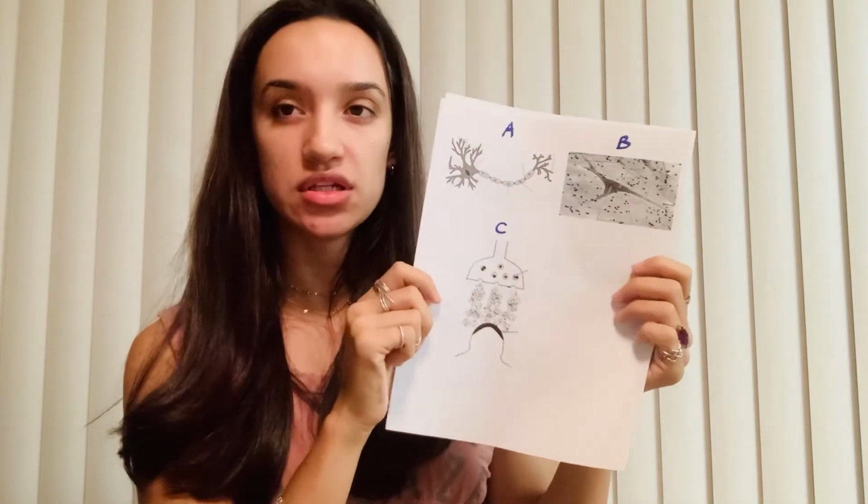Neurotransmitters are these chemicals right here. The neuroglia are these little cells here, and they are found all throughout the nervous system, the peripheral and central nervous system.